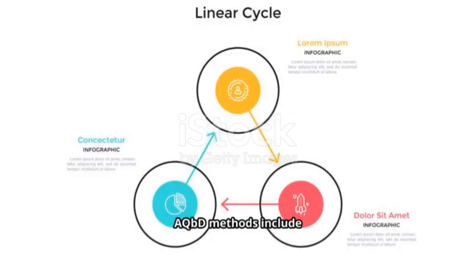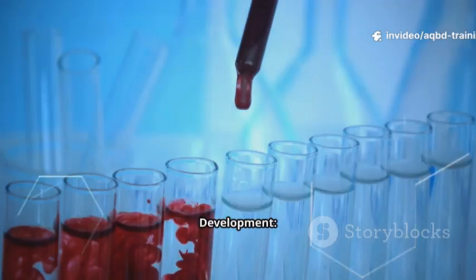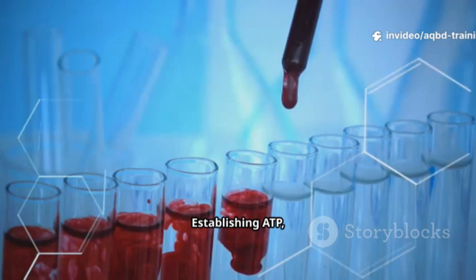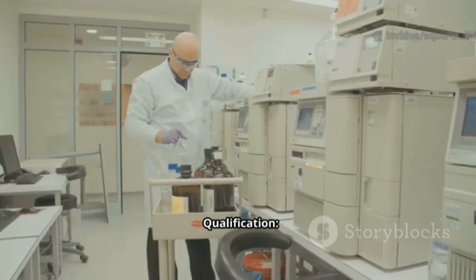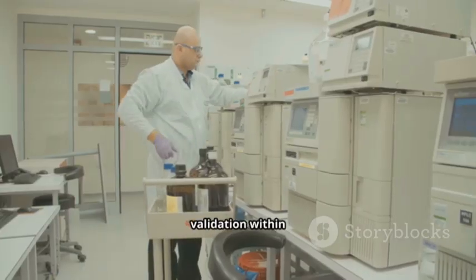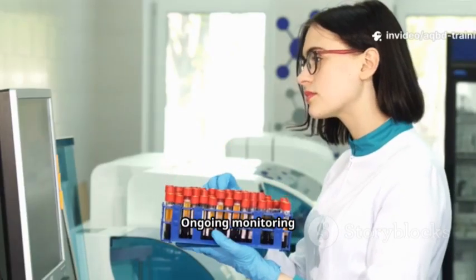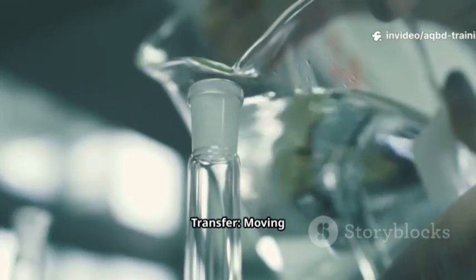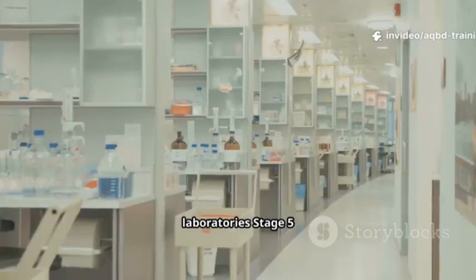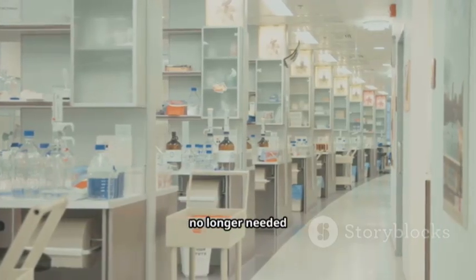AQbD methods include built-in lifecycle management. This involves Stage 1, development: establishing ATP, conducting risk assessment, DOE studies. Stage 2, qualification: formal method validation within the MODR. Stage 3, continued verification: ongoing monitoring and improvement. Stage 4, method transfer: moving methods between laboratories. Stage 5, method retirement: formal decommissioning when no longer needed.